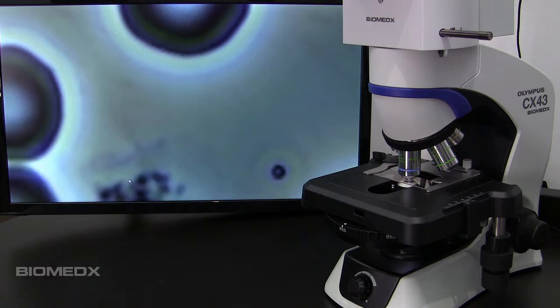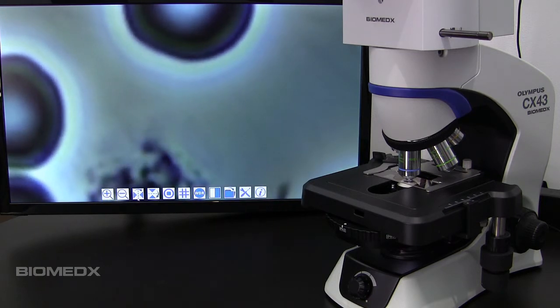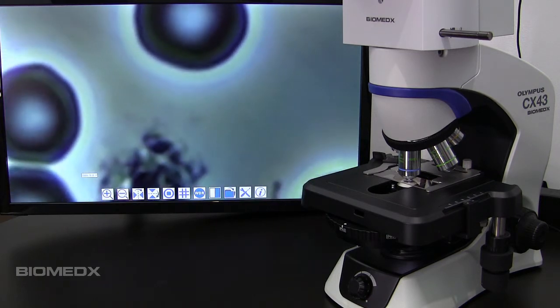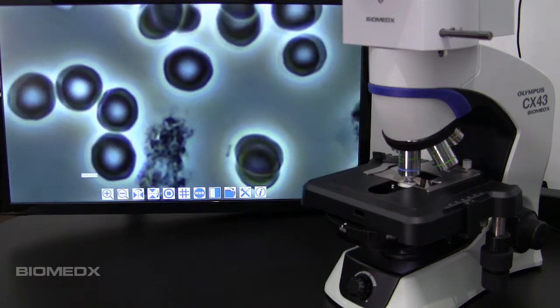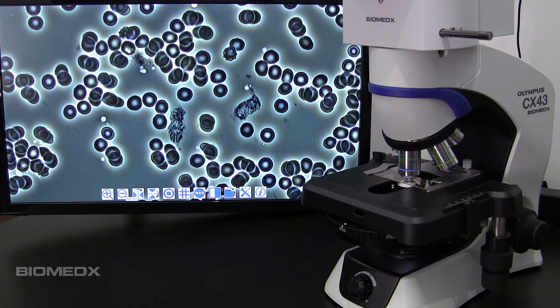I am going to take the video off of freeze frame now. And here we see a white blood cell coming up from the bottom. The world of the small inside of us is a fascinating place. When you get one of these systems, you will be well set to take people on a fantastic voyage into their blood.